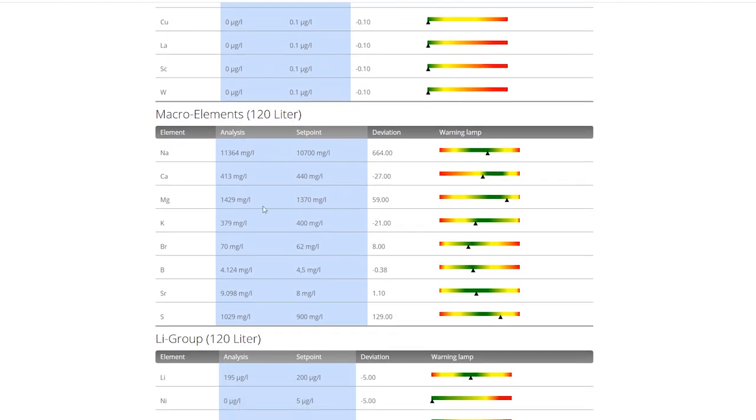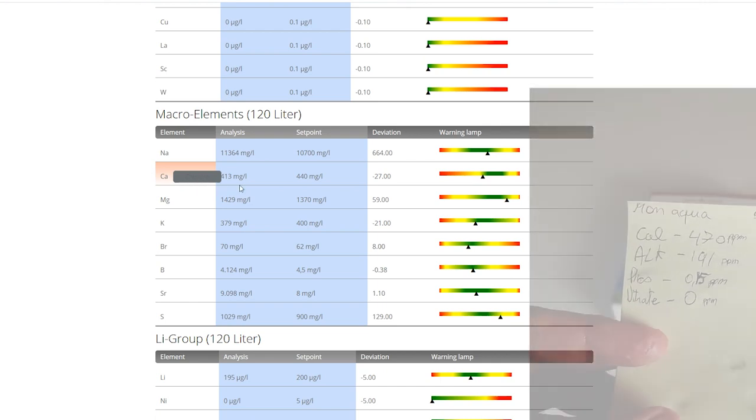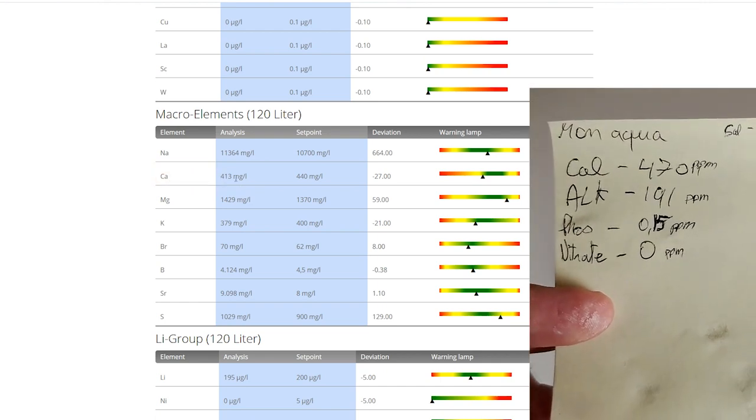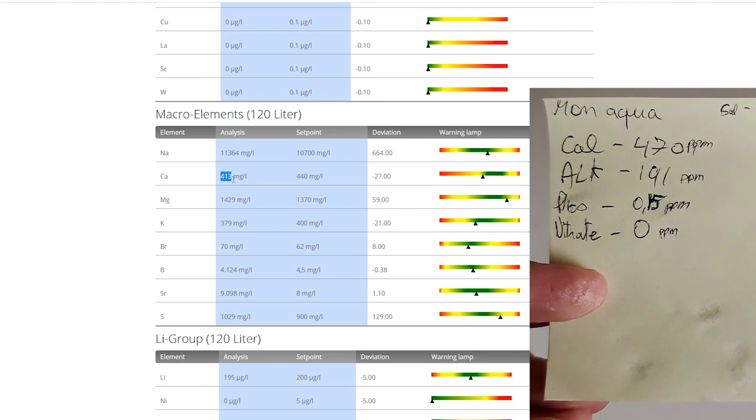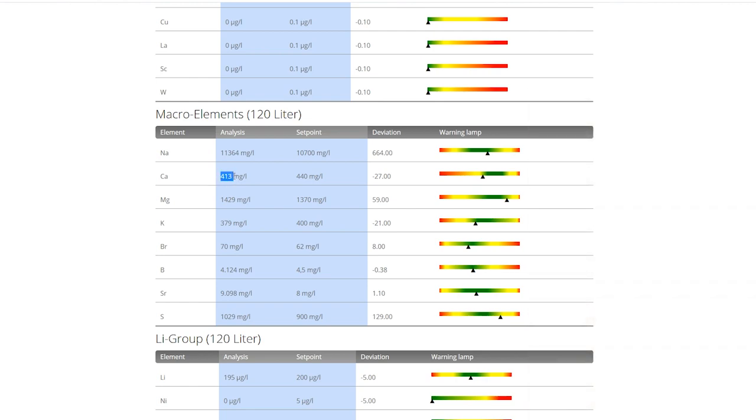So macro elements have the sodium, which is super important to see if my salinity is correct. So it seemed to be all right. I have the calcium, and when I did my test, I took note with my test kit, and I'm so far off from what I see. I think when I tested my calcium, it was a 470, and I see 413, so it's a big difference. So there's something wrong. I use the Salifert calcium test kit.